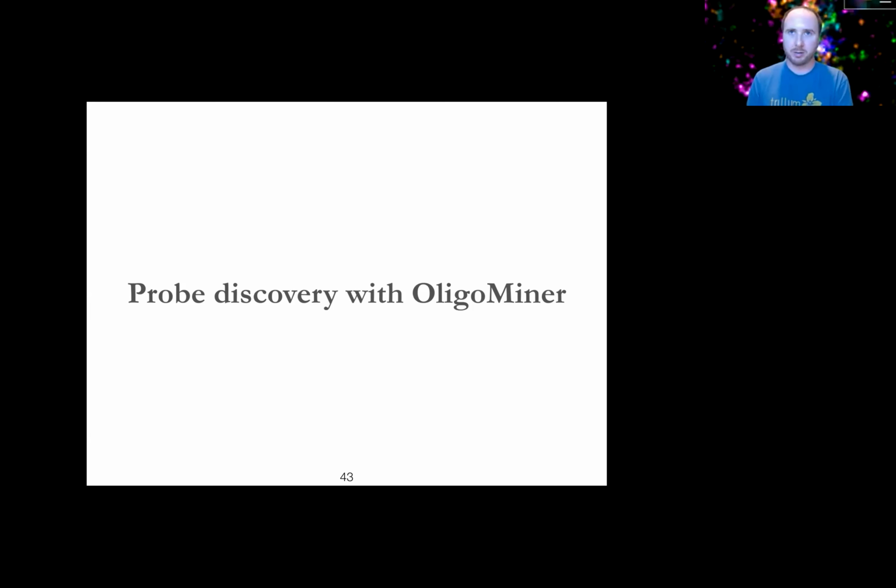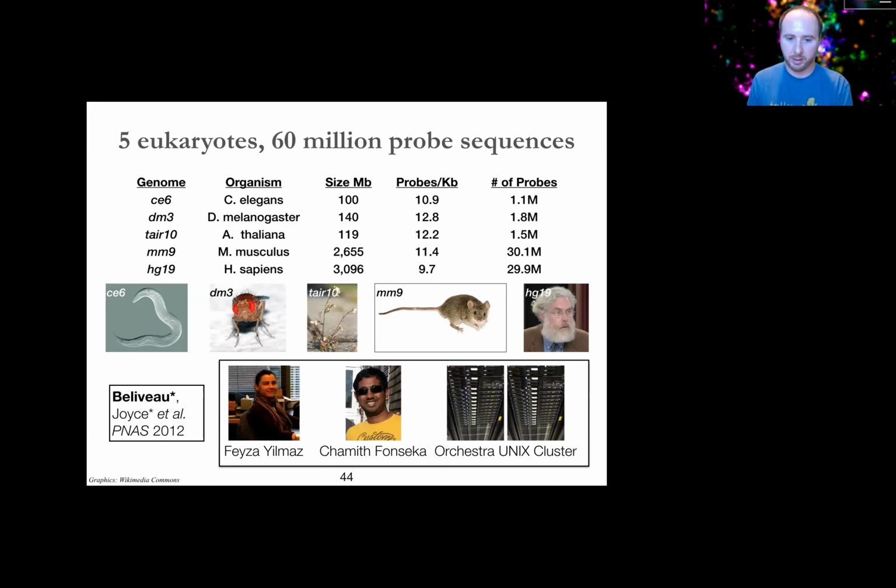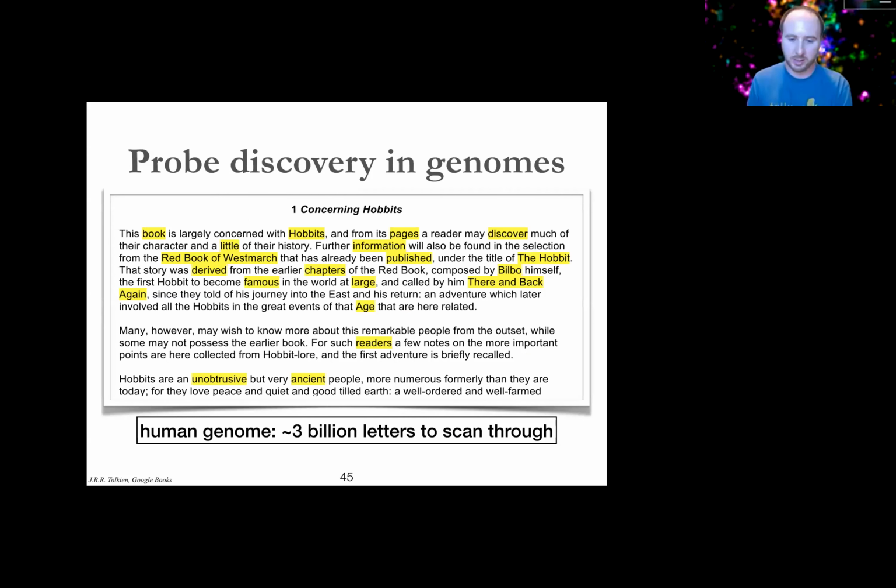Well, how do I know what sequences to order in my OPAL or whatever if I want to start doing RNA SABER for spatial transcriptomics? So a while ago, we introduced a bioinformatic pipeline wrapped around a utility called Oligo-array to do genome scale probe mining for the original Oligopaint work. It worked reasonably well. It was very slow. I'm going to skip through the details there. The problem is an interesting problem.